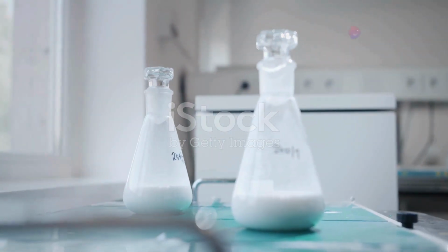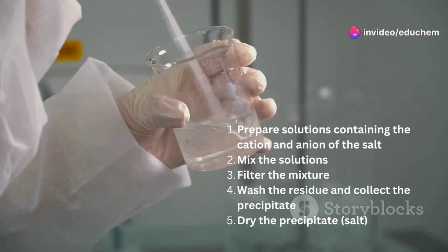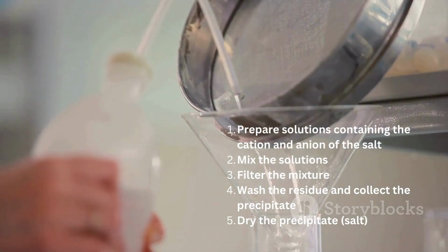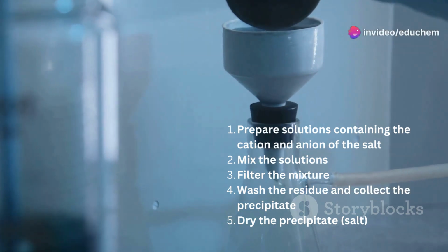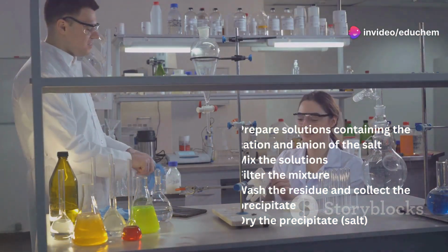The steps for this method are straightforward. First, prepare the two solutions containing the ions you need. Then, mix the solutions together. Filter the mixture to collect the precipitate. Wash the precipitate with distilled water to remove soluble impurities. Finally, dry the precipitate to obtain the pure salt. Remember, once the salt you want to prepare is insoluble, you must use ionic precipitation.